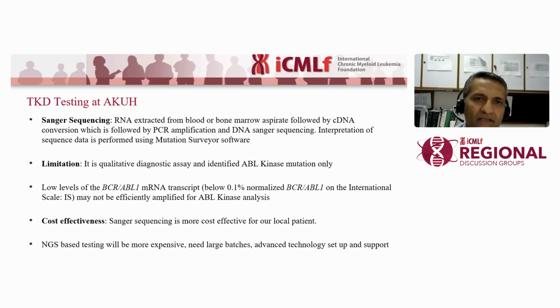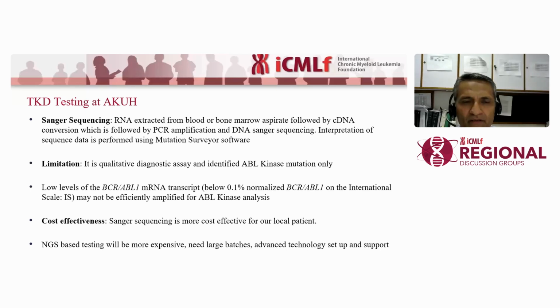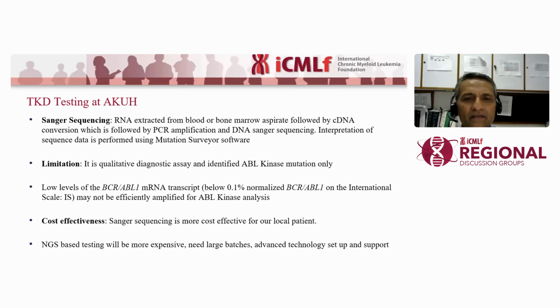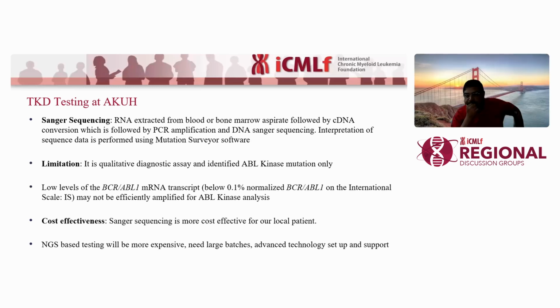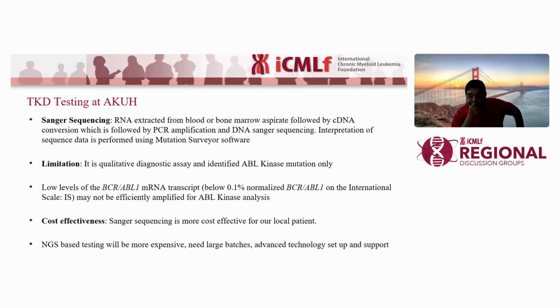We use specific software to read the sequence, and then we follow the literature if we detect any mutation. But there are some limitations to this test: it is only a qualitative test, and it does not quantify the mutation burden.